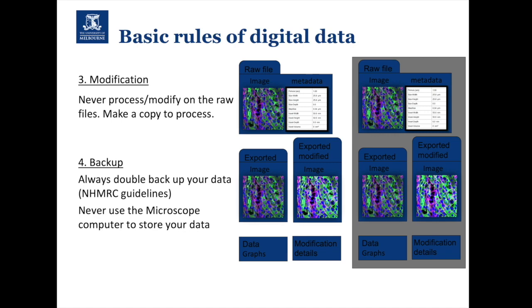So don't ever use the microscope computer as a safe place to store your data. There are instances where there are hundreds of people accessing those computers and they can either accidentally or deliberately delete that data off. I also suggest that you don't keep all of your data on an external hard drive. We've had a case in the past where someone's lost their hard drive with 6 months worth of work on it, and the only way of getting that work back was to go back and do all that work again. You don't want to be in that situation.